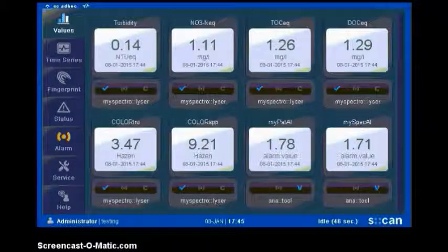So what we can see here now is that we already have the results of the new measurement with the orange juice in the reference slide, but both of the alarm algorithms did not trigger an event, which means that the training successfully adapted the behavior of both alarm algorithms.